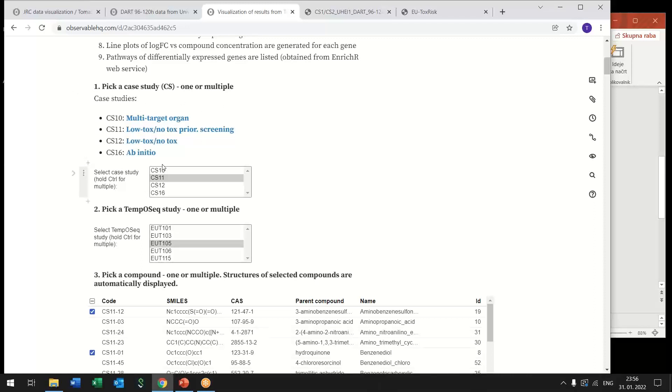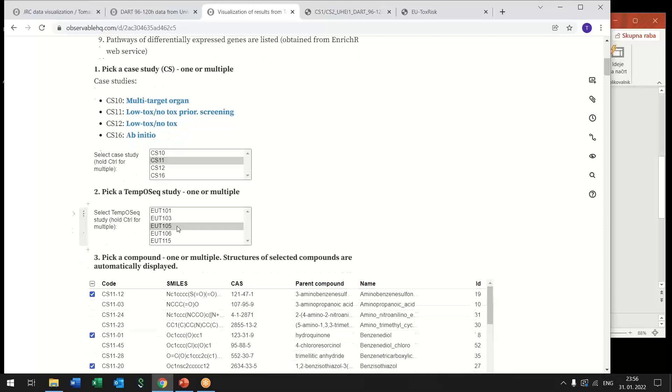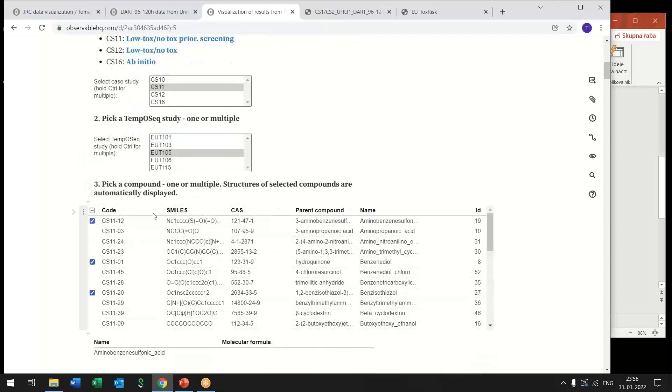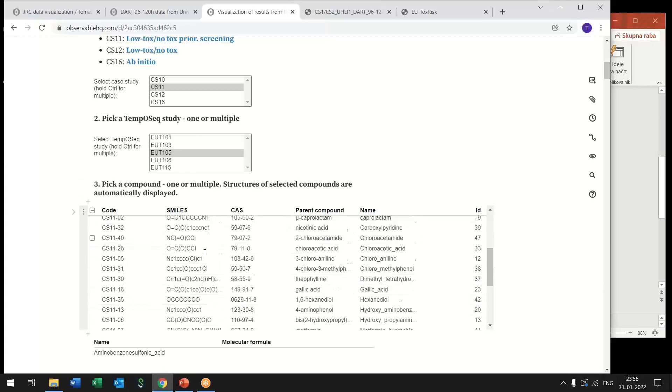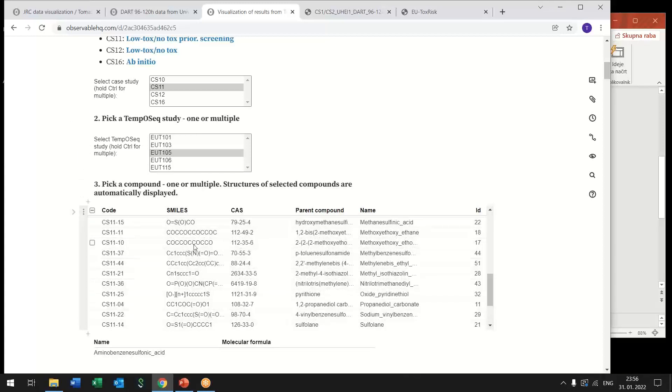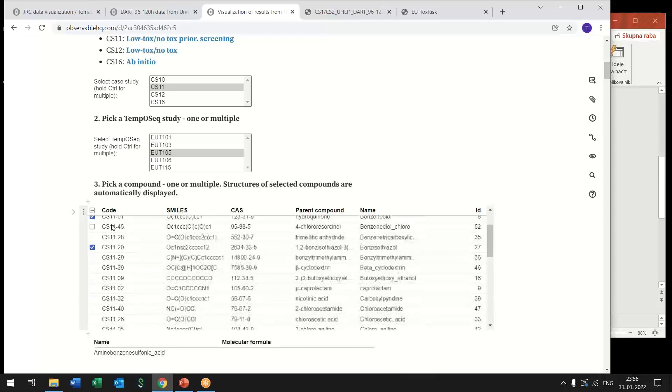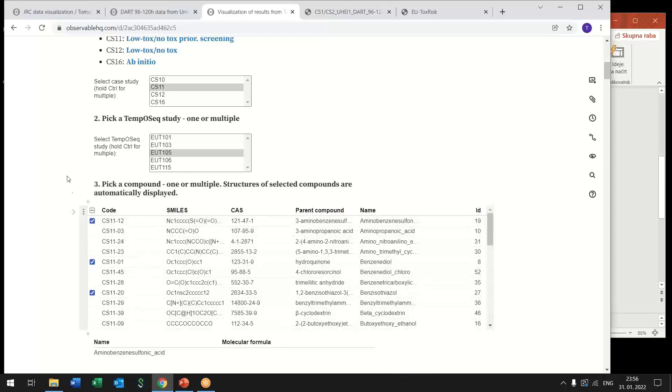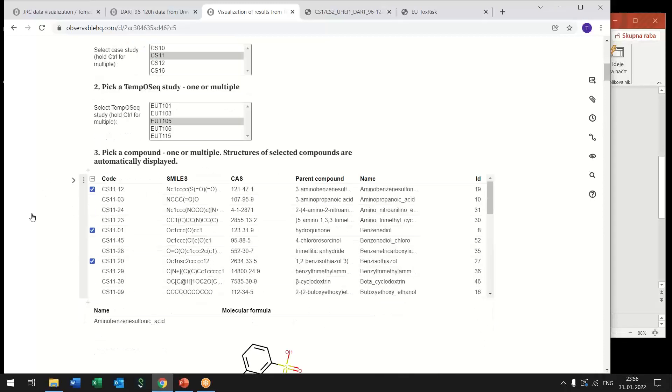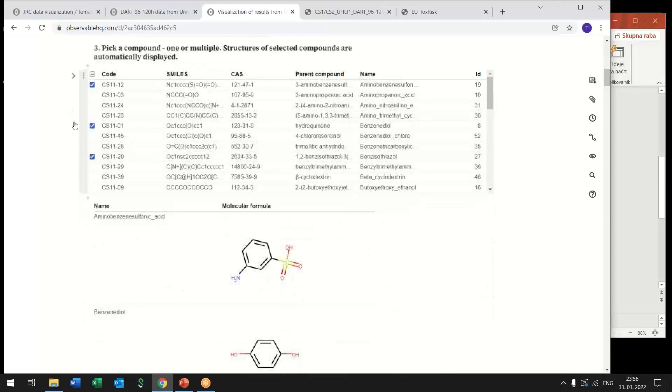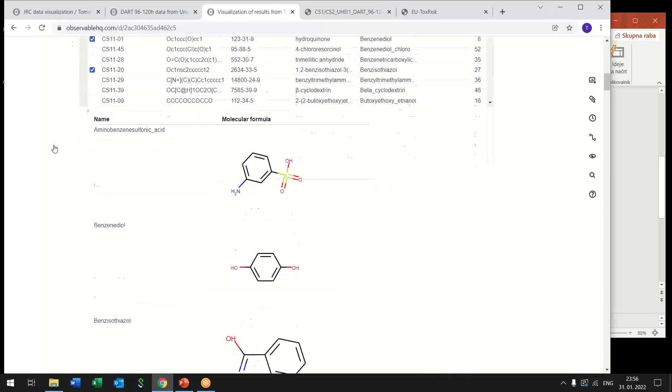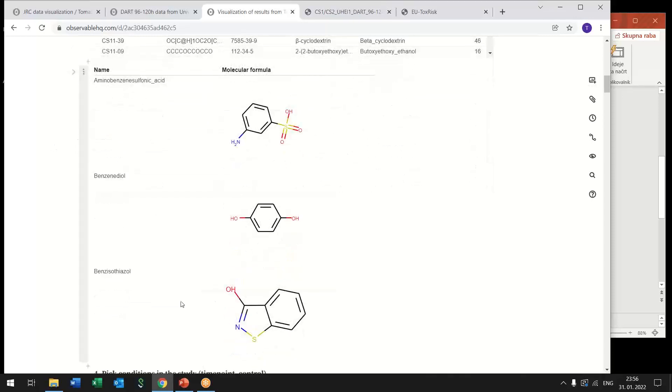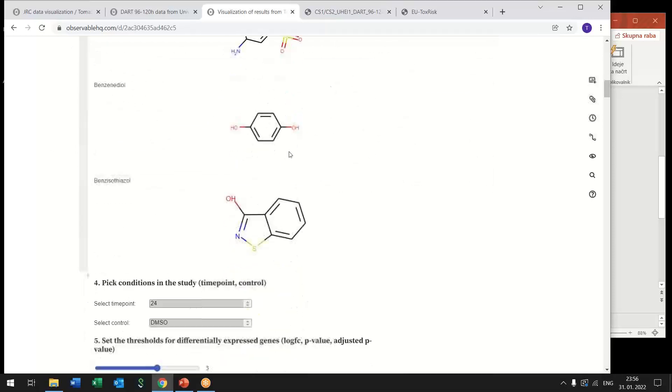First, within the EUToxRisk project this assay was running for case studies so user can first select one or multiple case studies then they can pick one or multiple TempoSeq studies and the list of compounds is again updated based on the selected case studies so only the compounds that were tested in that case study are shown.